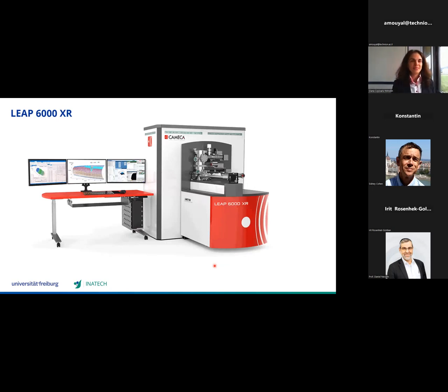This is the LEAP 6000 XR. So it has nothing to do with what Erwin Müller had at the beginning, these small crystal tubes. But here indeed we have really a big setup. On the left-hand side, we have the software. On the right-hand side, we have the hardware.